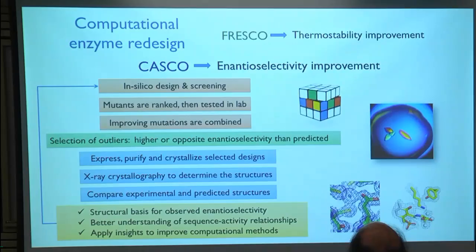That's for improving the workflow, because we can compare the quality of the predictions, check if there are any structural changes occurring in the crystal, and apply the insights that we get from the structures back to the computational workflow to improve it and try to make it a bit more enzyme-wide instead of specific to particular ones. So, thank you. I was super brief.